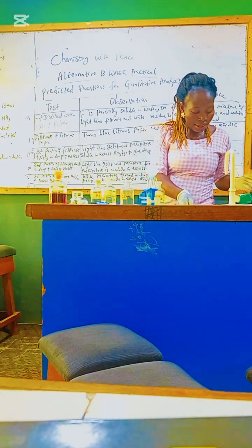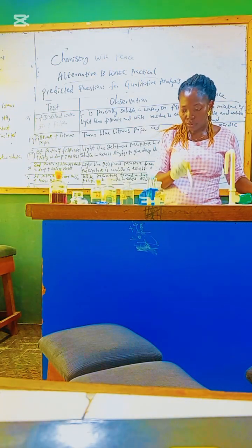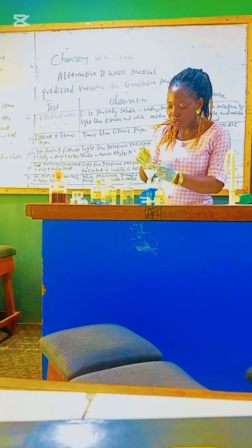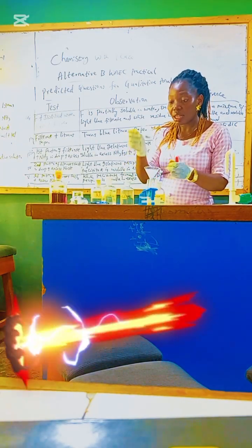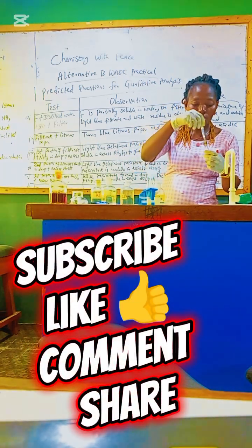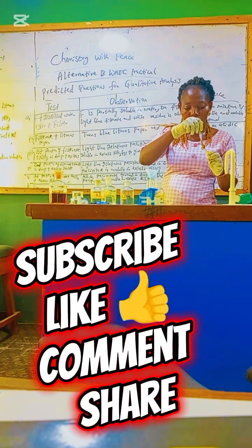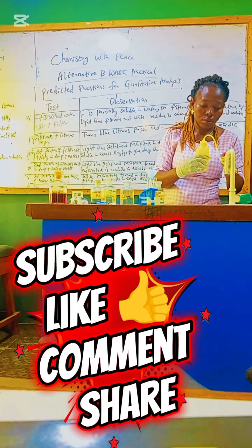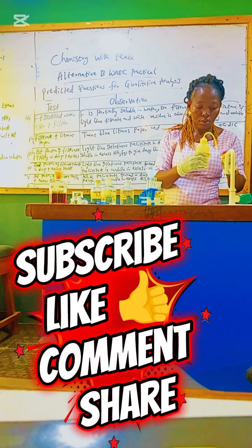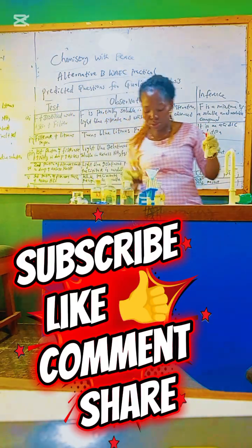Here is our residue on the filter paper. And here is my iodine solution.